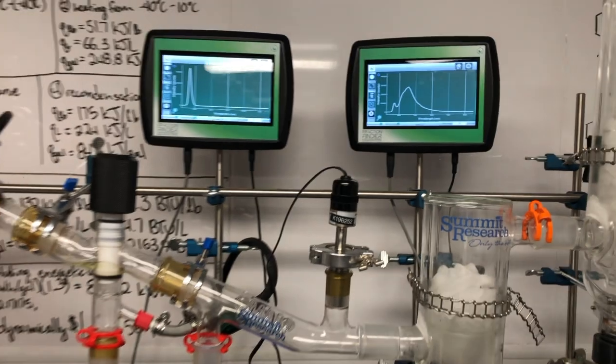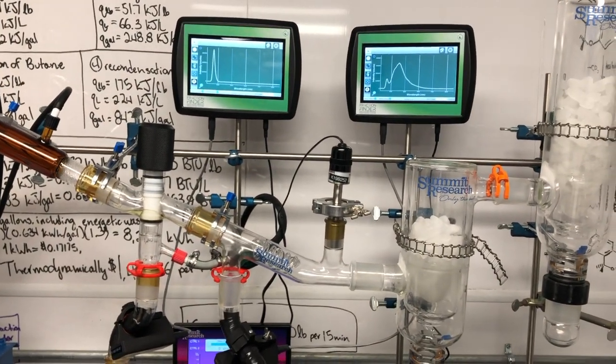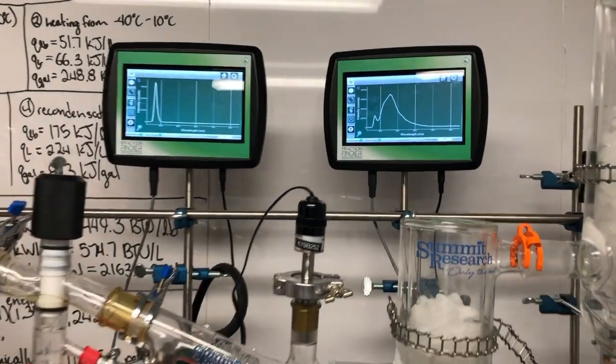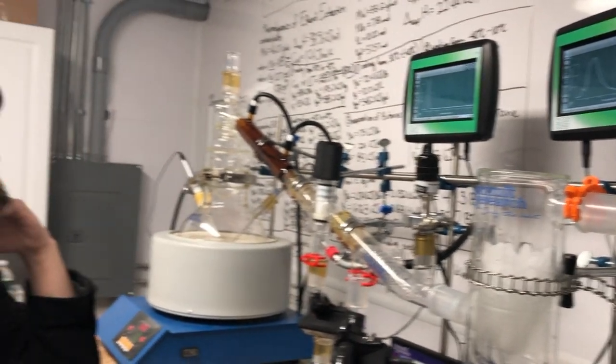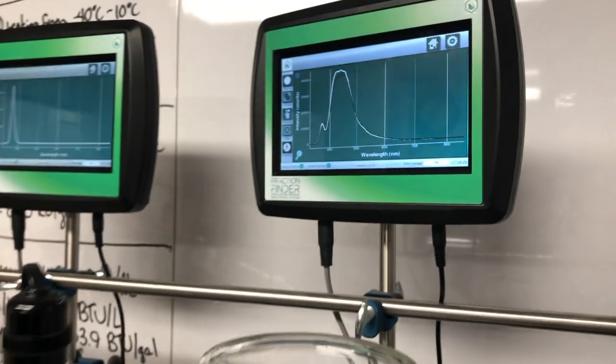Just because it actually has to flow through and start thinning out a little bit. We just got a reservoir that's dumping over the sensor. There's some CBD signal right there with some head signal. That's what we're seeing. Actually seeing pretty much the same thing that we saw yesterday, which kind of means that we're getting the same heads out that we got yesterday. That 410 peak is on the same level as the 460, as opposed to the overlay, which, if you come over in the black, was below the 460.